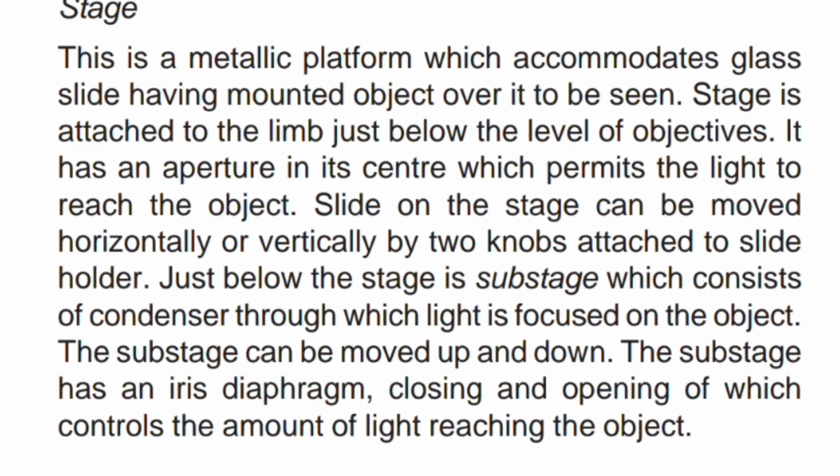Just below the stage is substage. Substage, which consists of condenser through which light is focused on the object. The substage can be moved up and down. The substage has an iris diaphragm, closing and opening of which controls the amount of light reaching the object.